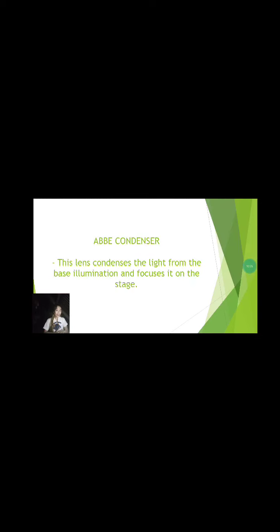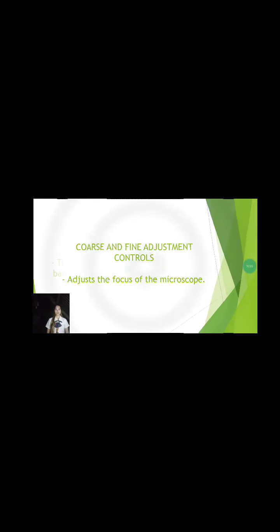So, nasabot ra? Okay, very good. So, let's proceed to the coarse and fine adjustment controls. Unsa man ni siya? It adjusts the focus of the microscope. This knob increases or decreases the level.